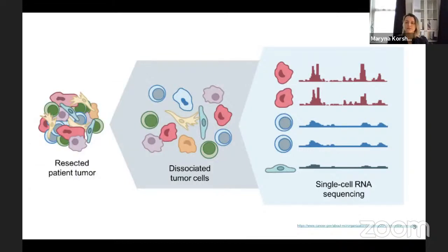Yeah, it was a very intriguing and very popular question when people in a lot of consortia have bulk seq and would like to impute or assume which kind of single cell data could be there. So actually there is already a developed set of methods called bulk sequencing data deconvolution, when you try to apply different computational tools.